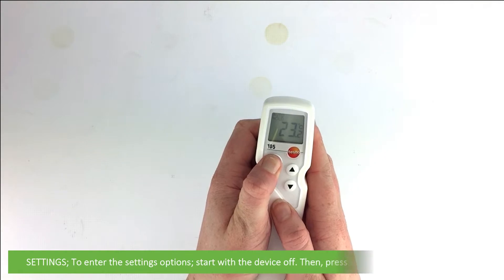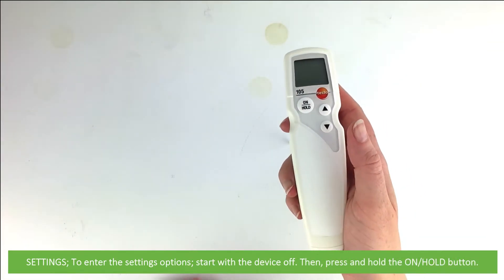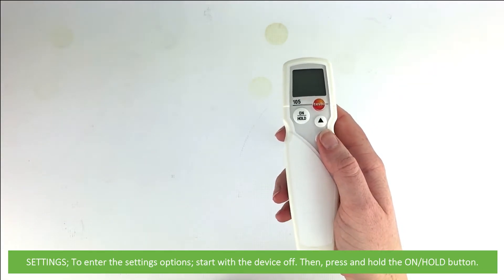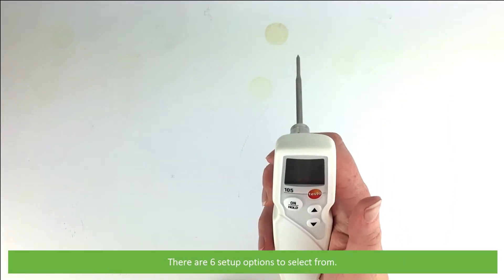Settings: To enter the settings options, start with the device off, then press and hold the on hold button. There are six setup options to select from.